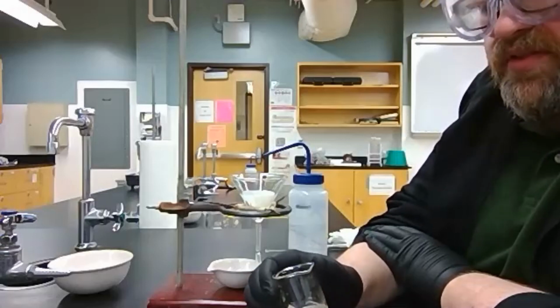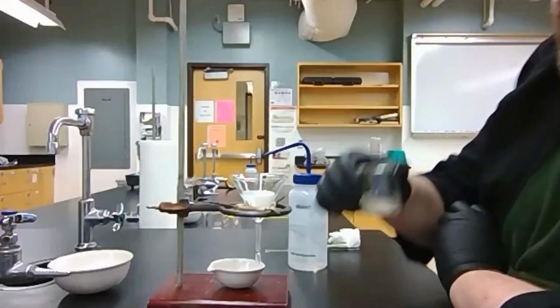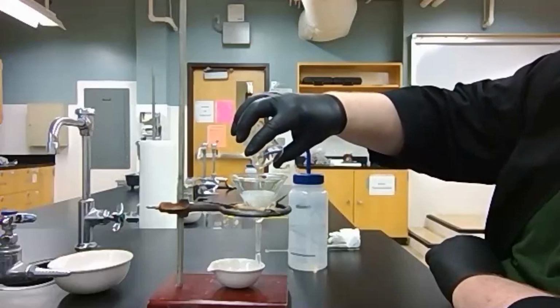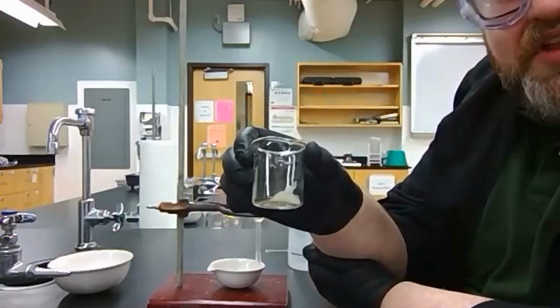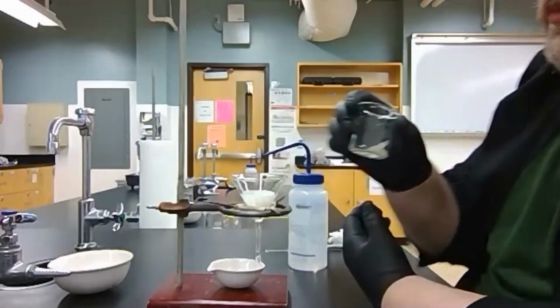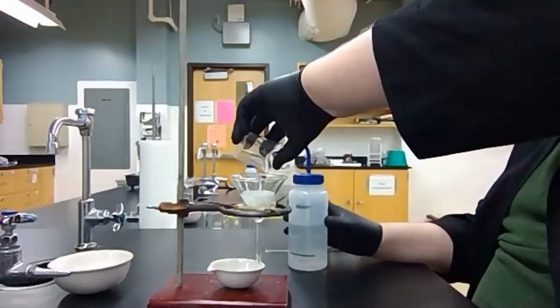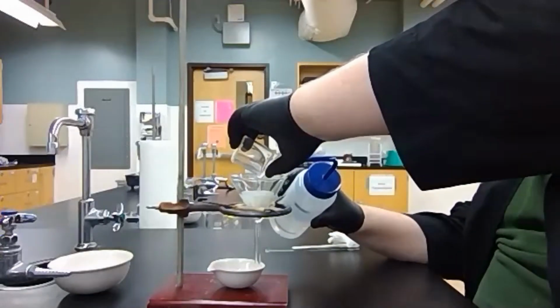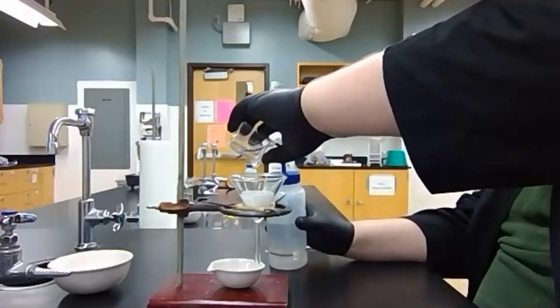But that sand really wants to sit on the bottom of my container. So to get it out, I'm going to give it a good swirling as I pour it onto my filter. Now, there is lots of sand left in there. How do I possibly get that sand out of here? Well, luckily, I've still got a little DI water sitting here. So what I can do is tilt this upward and use just a little bit of extra water to rinse any of that excess sand into my filter.